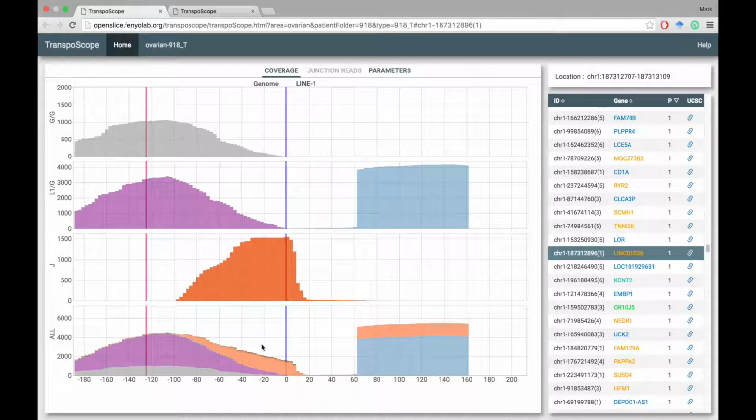The base pair consistency statistics show when you hover over the histogram. This data set looks excellent. However, consistency is unsurprisingly substantially lower in the poly A tail region. Homopolymer regions do not sequence well.